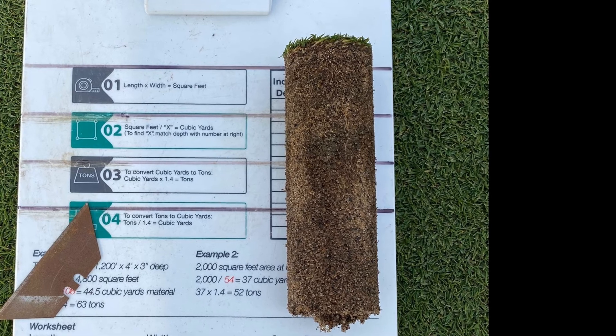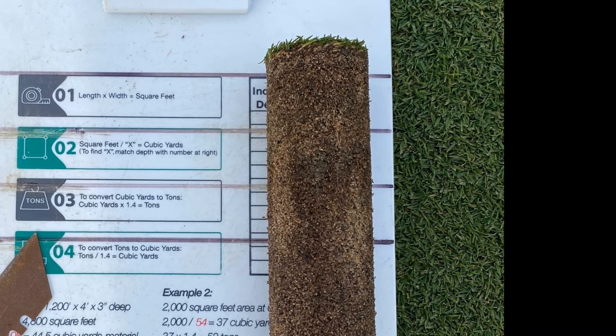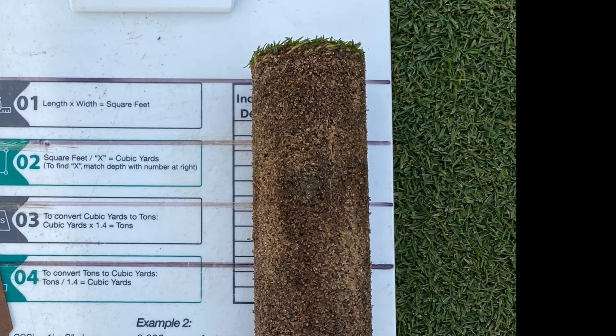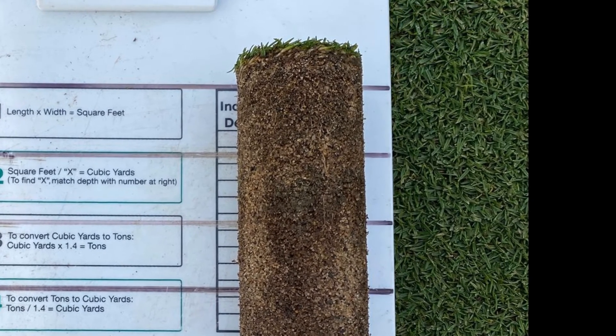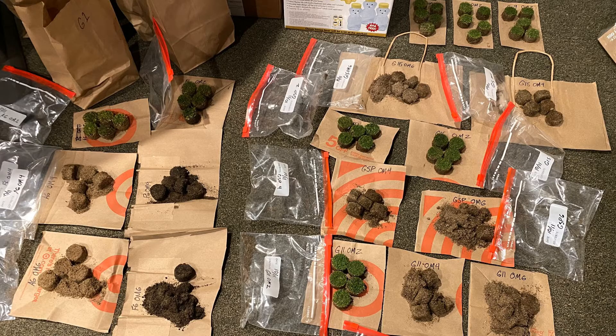This is what is called a loss on ignition test. The mass of the sample is measured prior to burning and then again after burning. The difference in mass after burning — the loss on ignition — that's the organic material. Sand and soil don't burn at 440°C, but organic material does, as you will see.